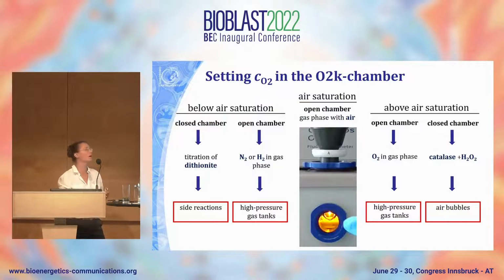in a central way, or you have to have this gas tank in the lab. And this is quite inconvenient. It's, first of all, a safety issue. You have to handle the high pressure, so it's kind of complicated. Or you don't even have it in your lab, and then you have to go somewhere else. So we were thinking about having oxygen and hydrogen in the lab, but not in the form of a high pressure tank, and it should be always available.